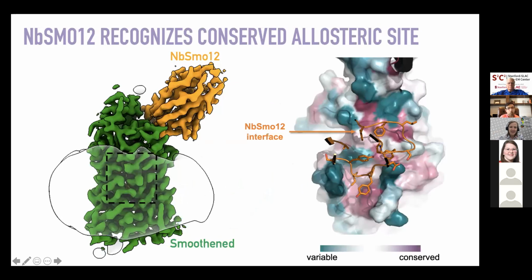Yeah, so I will say that this is the only example that we've gotten. This has emboldened us to do more nanobody-driven fiducials. This work is very hot off the press. I think we only got the structure about 3 or 4 weeks, or maybe 6 weeks ago. We are now emboldened to try other nanobodies that we've discovered over many years and to see if they're sufficient to drive particle alignment of GPCRs. My gut feeling is that because the center of mass of this nanobody is not that far away from the center of mass of the GPCR, we won't get these very profound local resolution problems.